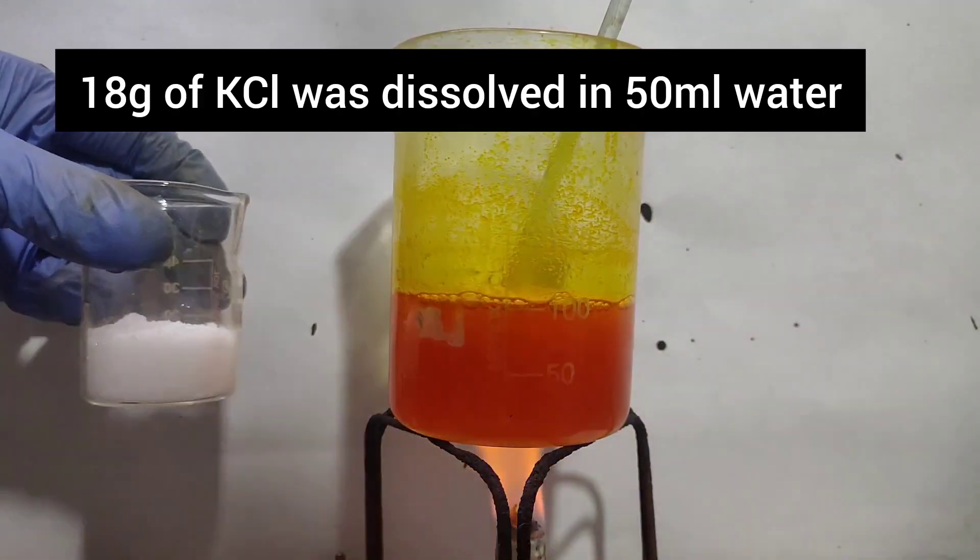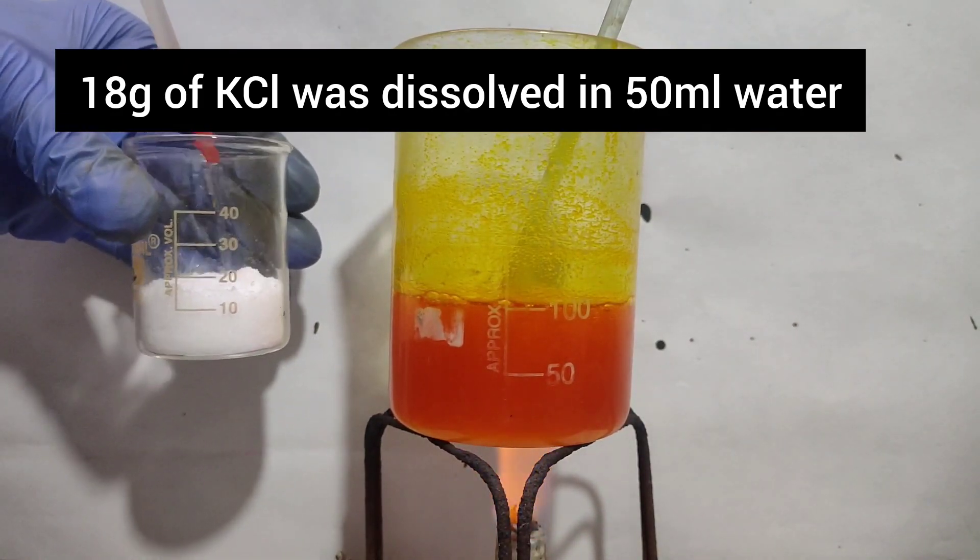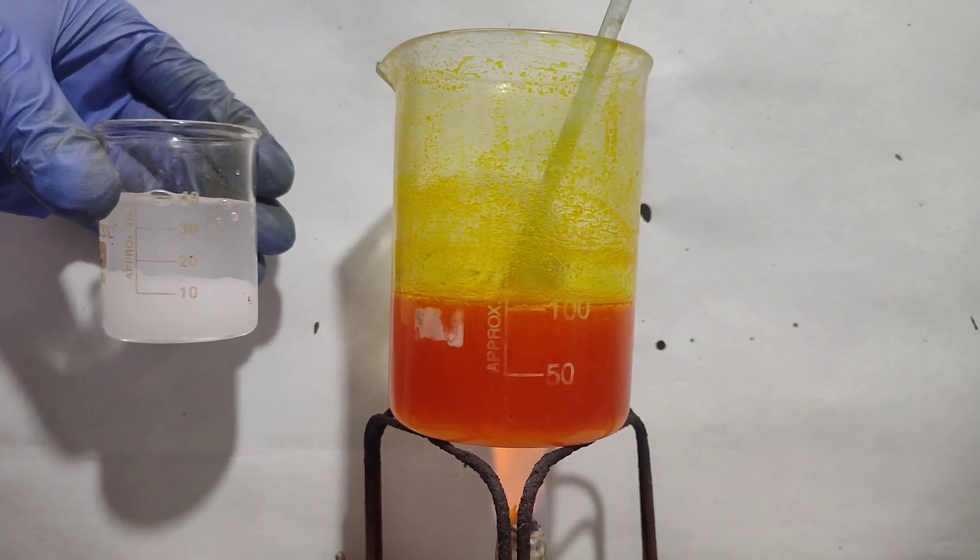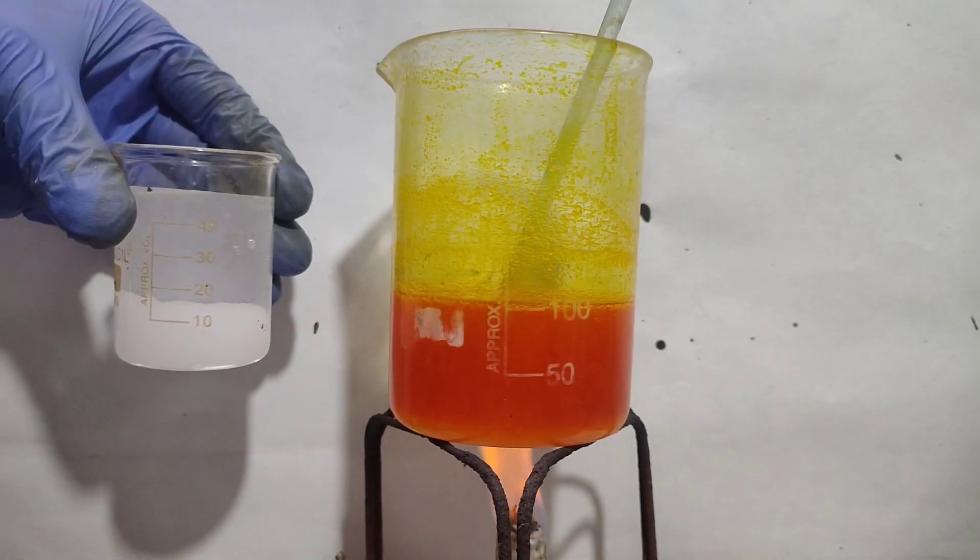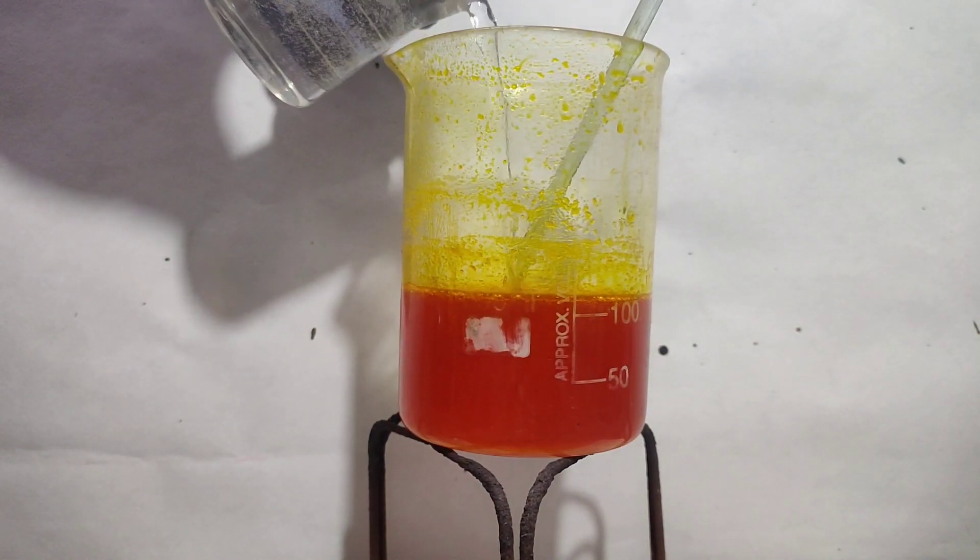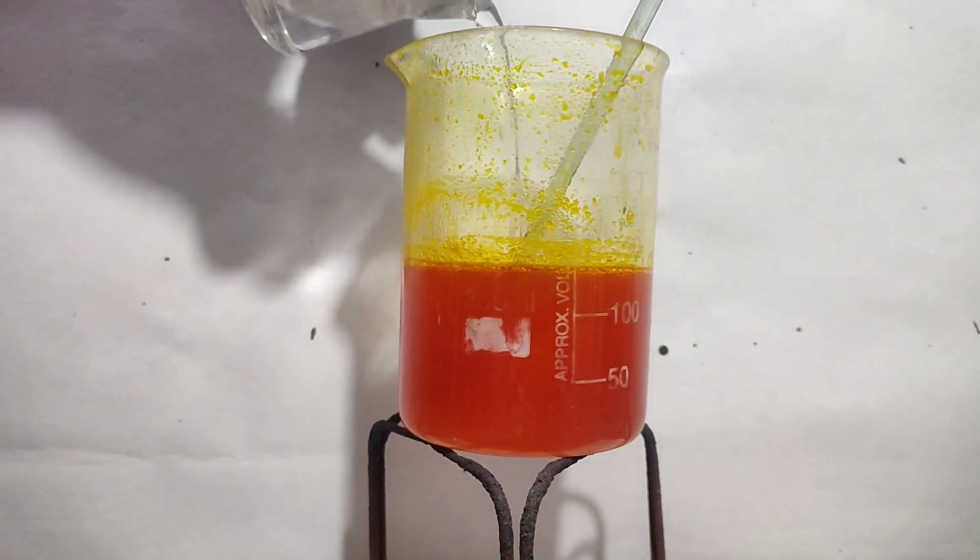I heated this solution so that all the solids would dissolve and simultaneously dissolved 18g of potassium chloride in 50 ml distilled water. After the solution was prepared, I added this solution into the sodium dichromate solution.